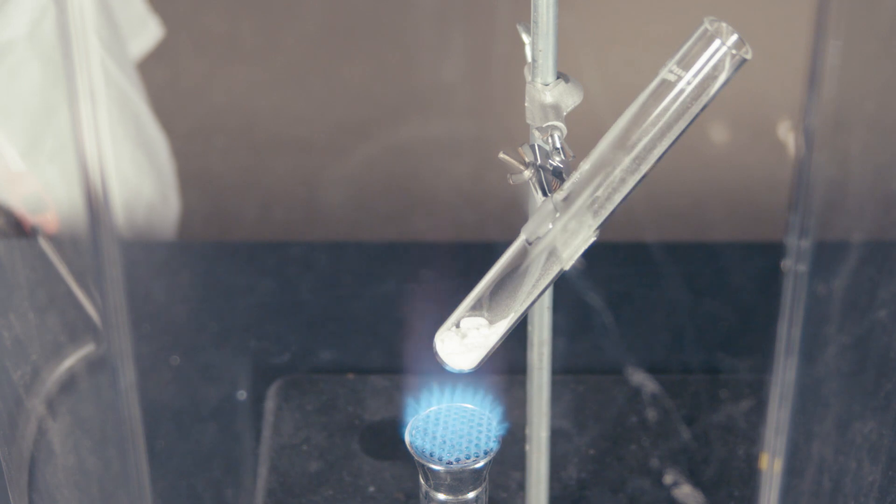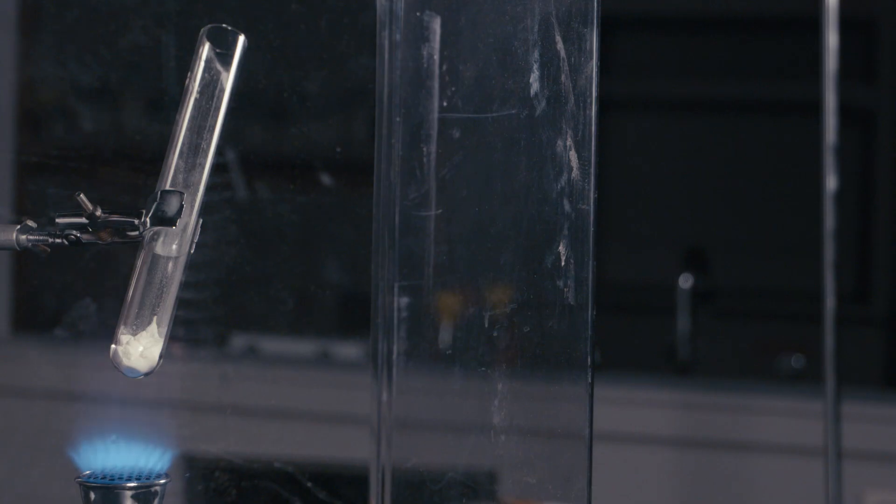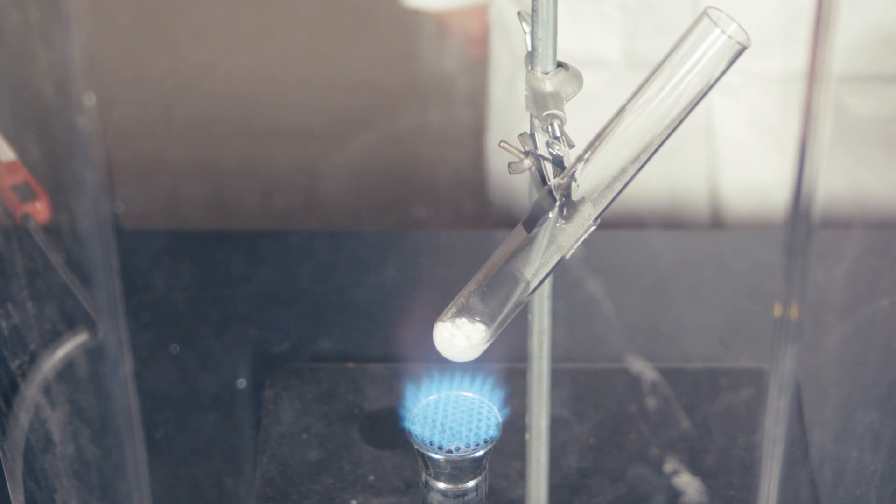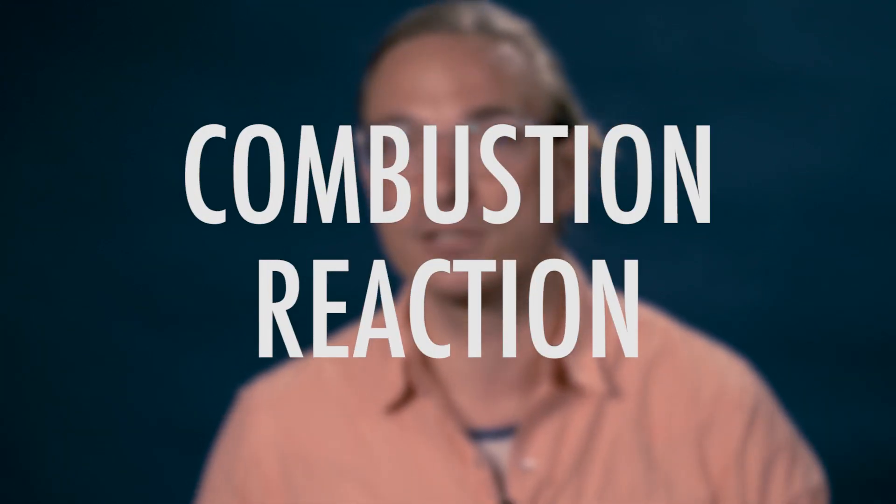To 5 grams of our compound in an ignition tube, we're going to heat it up to about 700 or so degrees until it becomes molten. And what happens next may surprise you. Just kidding, this isn't clickbait. You're already watching. But because potassium chlorate is a strong oxidizer and therefore pulls electrons away from atoms, that is exactly what makes this a combustion reaction.